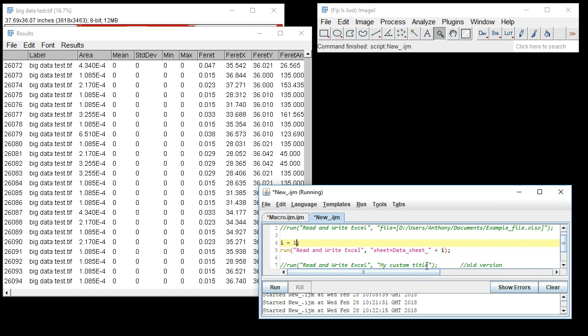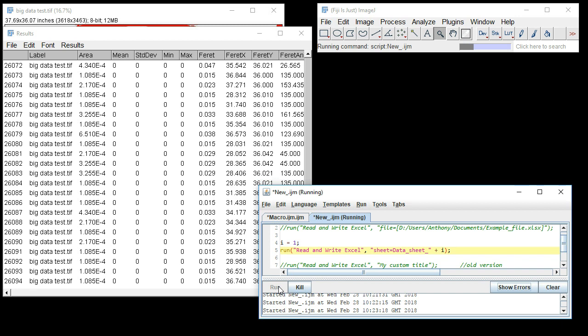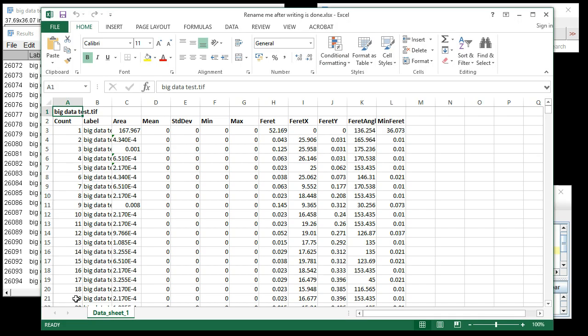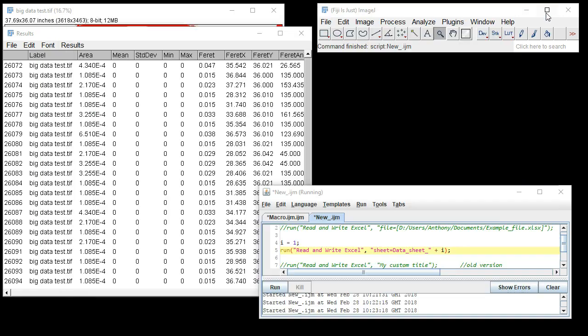If you run this, on our desktop, because that's the default location without that parameter changing, you can see that now rather than A we have our custom sheet tab. I'll close this and show you that if this is then changed.